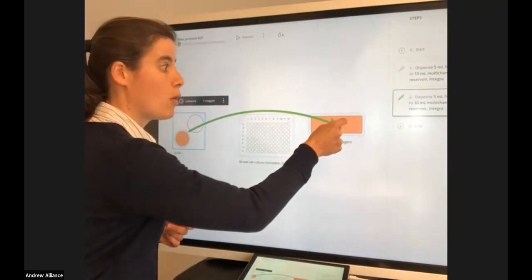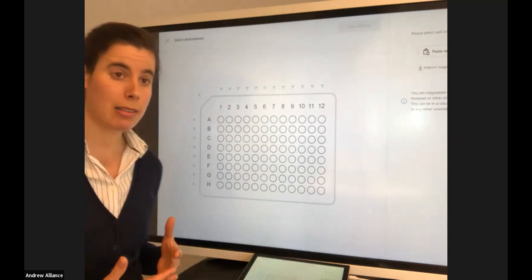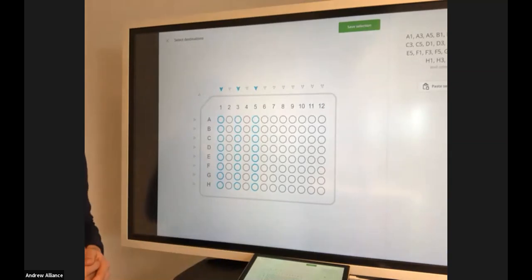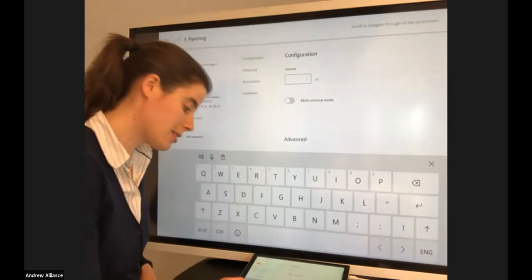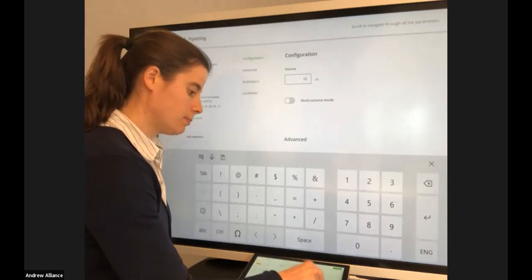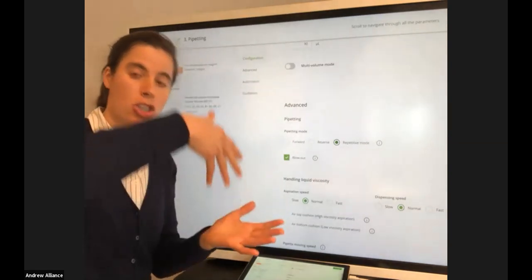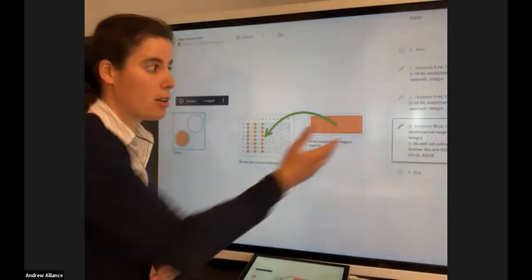So for example, now we can go from our reservoir, click and drag, to our microplate. What pops up is the actual microplate, and now we can indicate the columns we want to pipette into. For example, 1, 3, and 5. You can see them highlighted here in blue. You also see the wells that are selected. I can say Save Selection. And again, the volume is being asked. What I'll do is I'll say I want to pipette 90 microliters in each one of these wells. I can go down to Advanced, and I can say in this case, I would like to do repetitive pipetting. What does that mean? You pick up a big volume and you dispense smaller aliquots, in this case of 90 microliters in each well. I will click Save Step, and there's our third step right there.